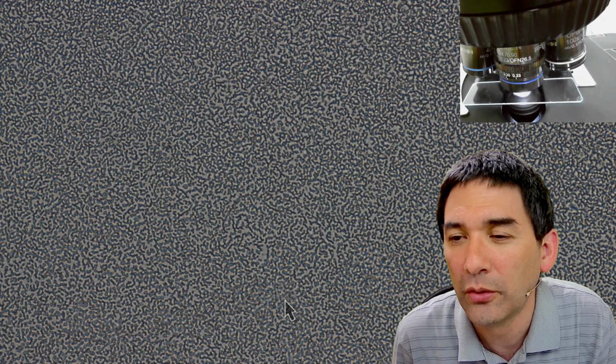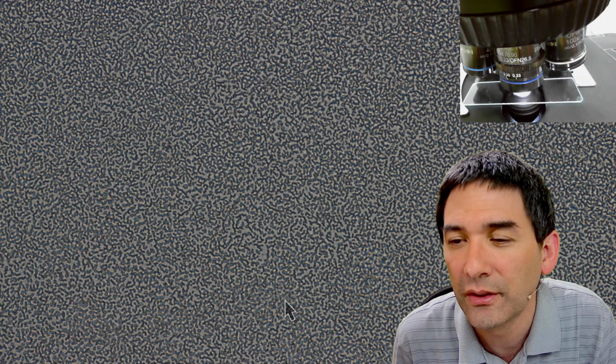So, and I will go down here. Yeah. So this is fascinating. Wow. Which Petri dishes are you using?